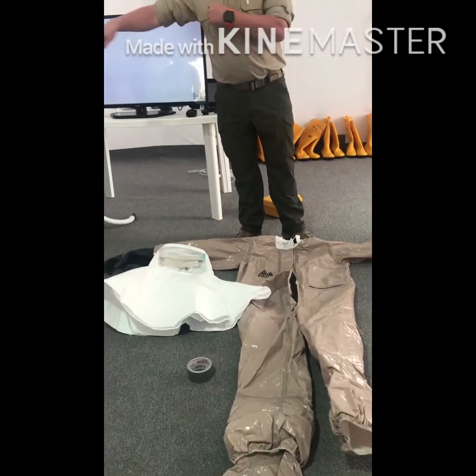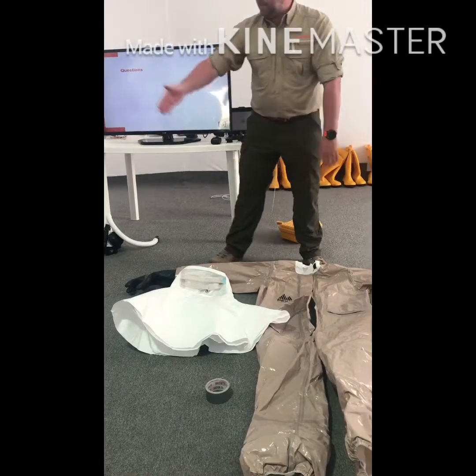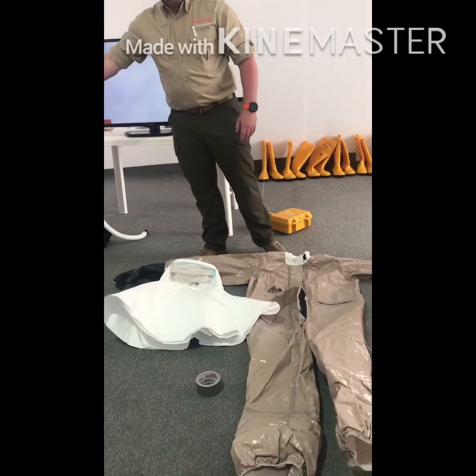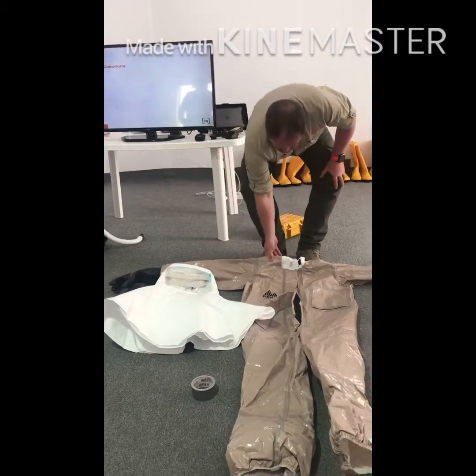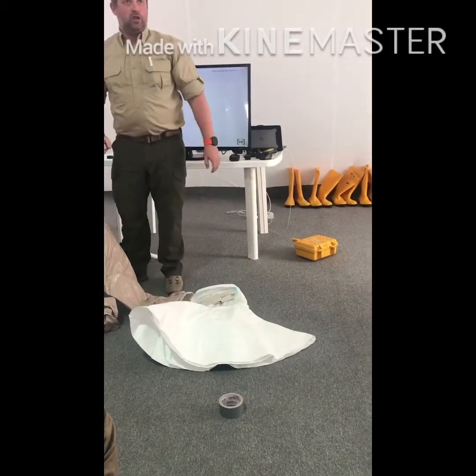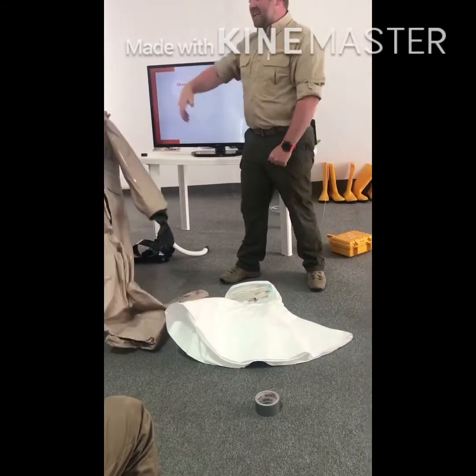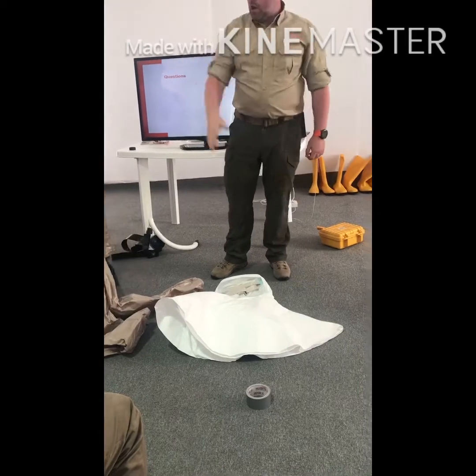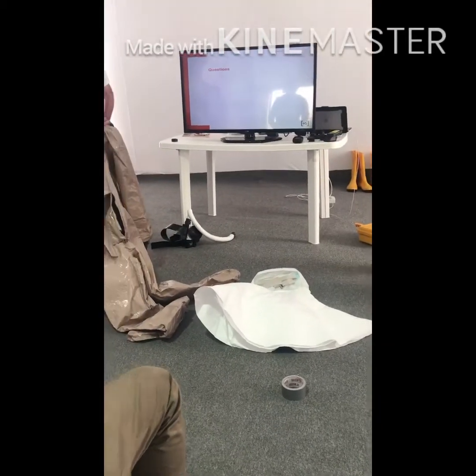When we don and doff, it's always 2 people. The person that checks the equipment is the person that's going to wear it. Okay? Not the person putting it on them. Okay? So she will now check, that's in the bag. She checks the expiry date's good. Okay? She then opens the bag and takes the suit out. And she's going to check that there's no breaks, no rips, no damage to that suit.